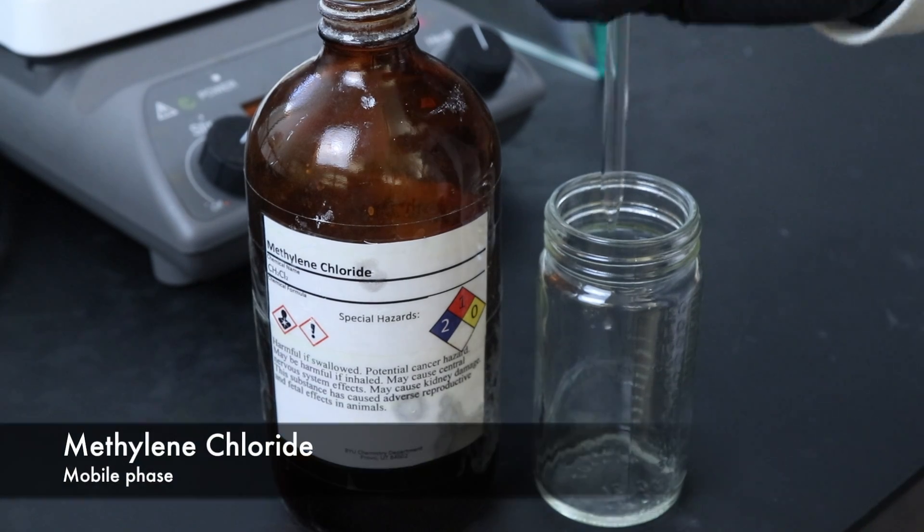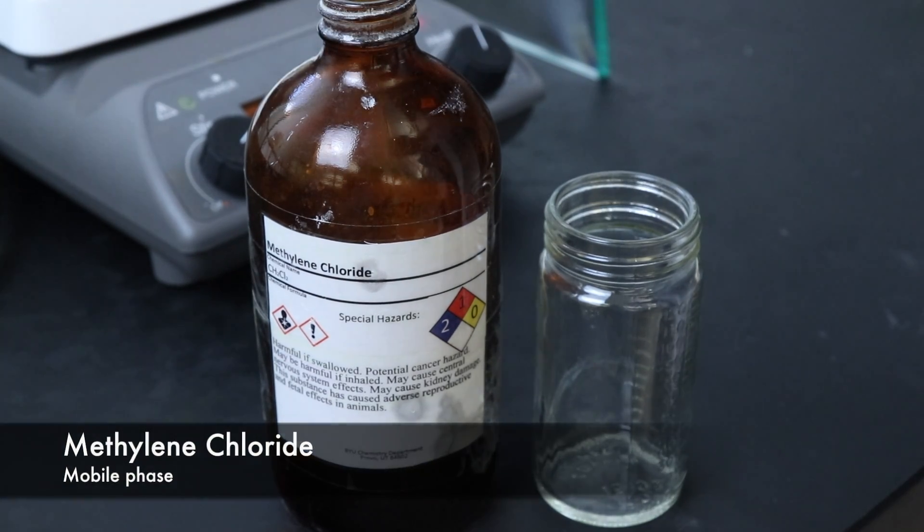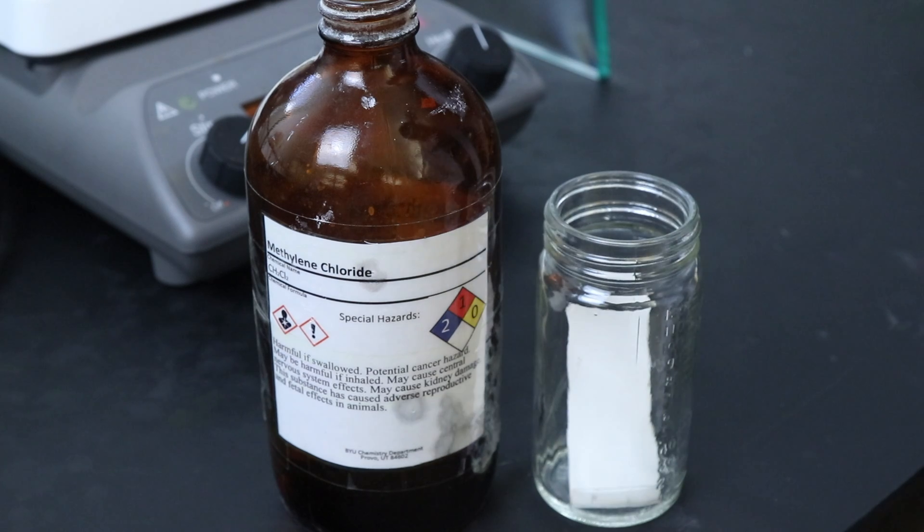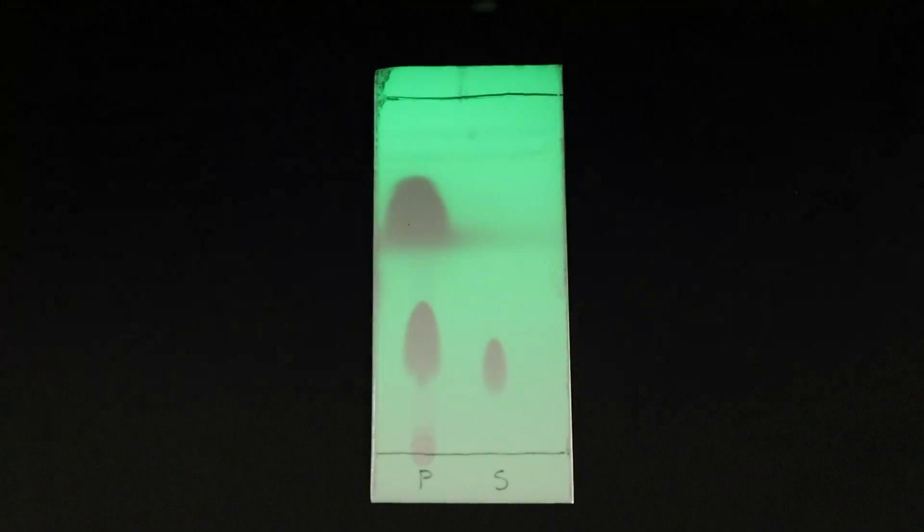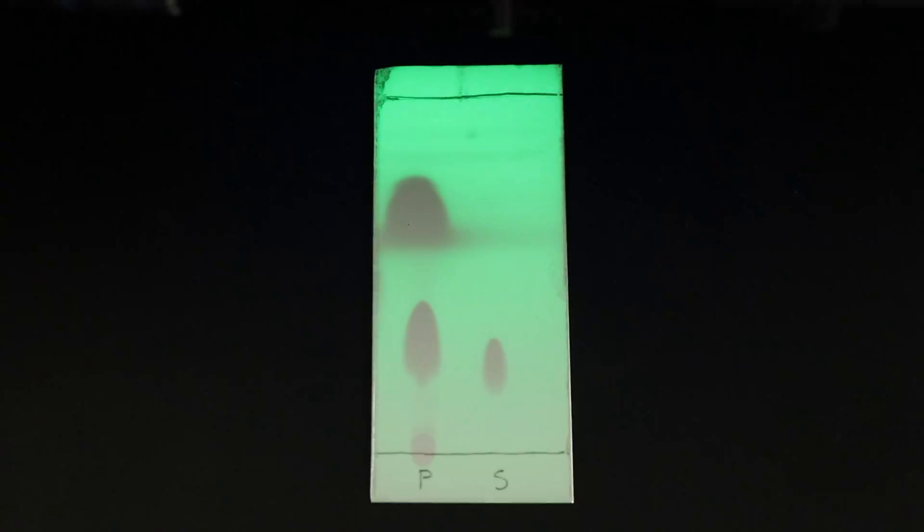Methylene chloride will be used as the mobile phase to develop the TLC plate. Here we can see that the product is definitely forming but there's still quite a bit of benzaldehyde.